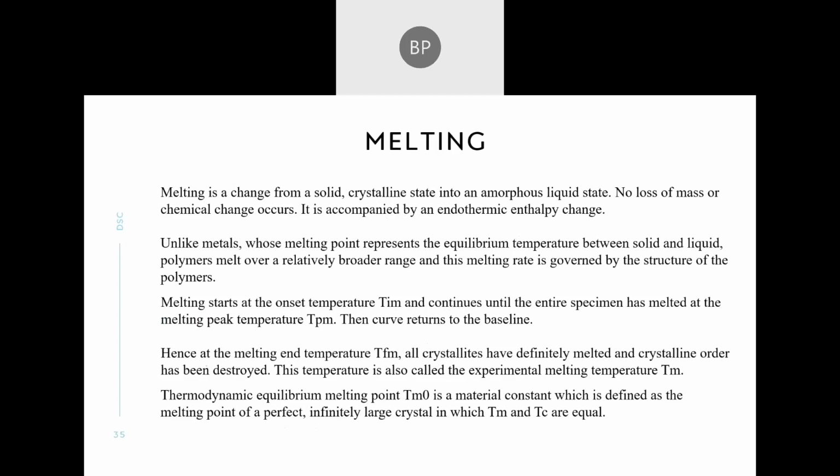So yeah, coming to the next transition, that is melting. Melting is the temperature where a polymer changes its state from the solid crystalline state into the amorphous liquid state. Beyond this melting temperature, we don't observe any more solid polymer.